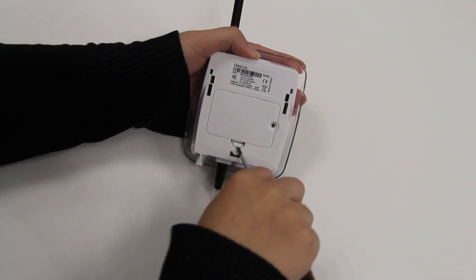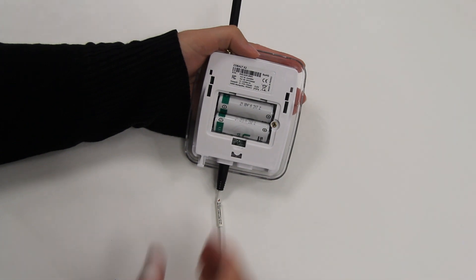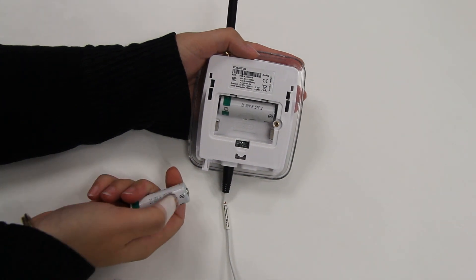Replace the batteries one at a time if your logger is not connected to a USB power bank or AC power. As you install your new batteries, ensure the positive and negative polarities are in the correct orientation.